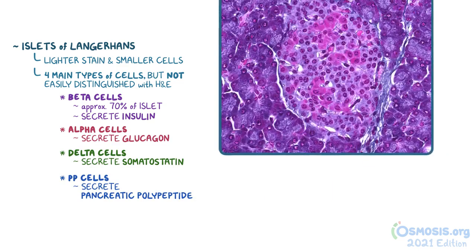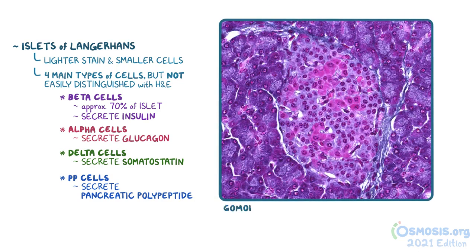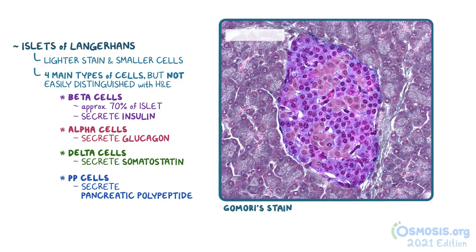This image of an islet was stained with Gomory stain, which allows us to differentiate the beta cells that stain bluish-purple and the alpha cells that stain pink, and we can also see just how much of the islet is made of beta cells. In individuals with type 1 diabetes, there will be a decreased number of beta cells as a result of autoimmune destruction of these cells specifically.